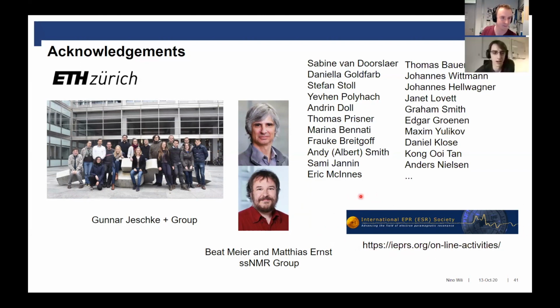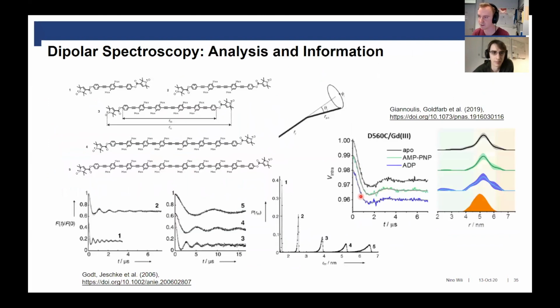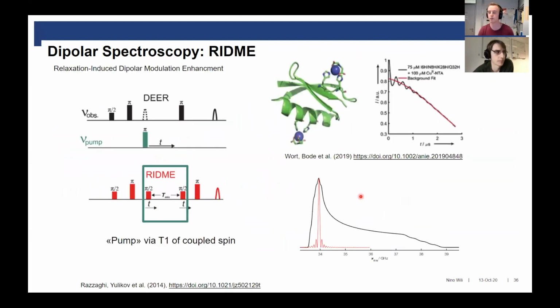Okay. So, quick question from an anonymous attendee. Can you comment on when to use which spin labels for dipolar spectroscopy, and which you would use, RIDME or DEER or DQC? Okay, that's good that we just do it like this. So, I mean, the standard, I would say, is still nitroxides and DEER. They're just kind of a very good match.